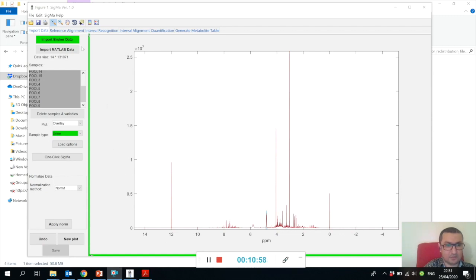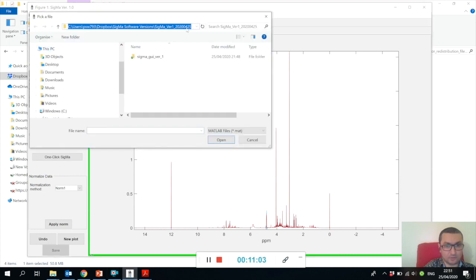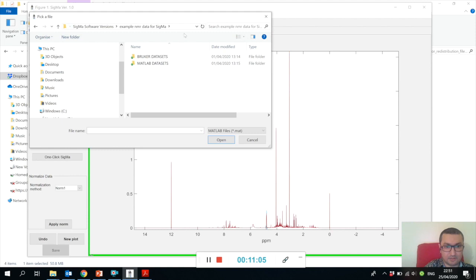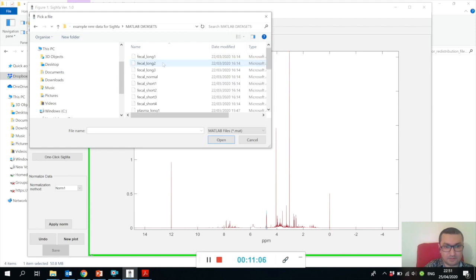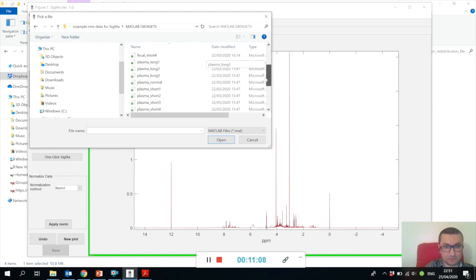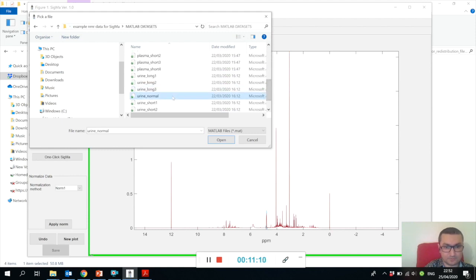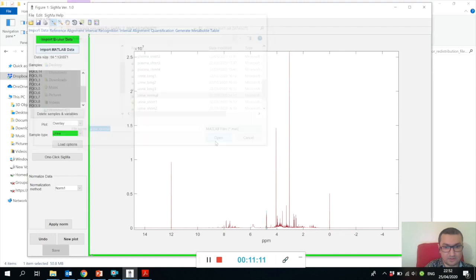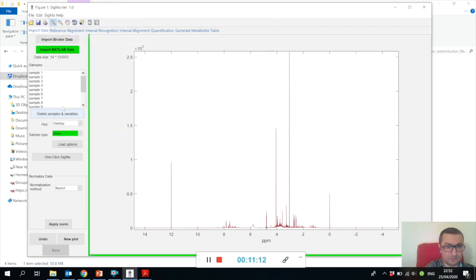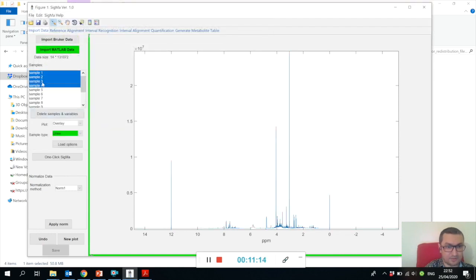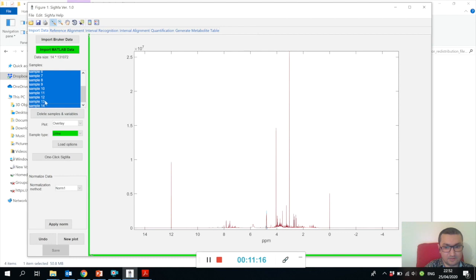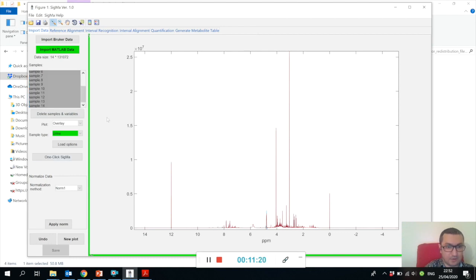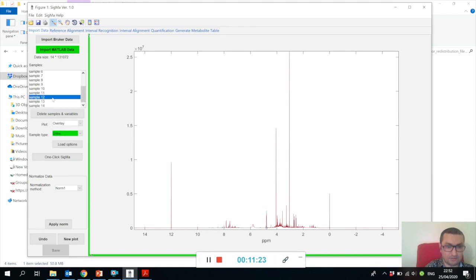I showed you how to import Bruker data. Let me show you how to import MATLAB - it's very simple also. I prepared some MATLAB datasets ready, so let me just open one urine dataset. It's actually the same spectra.